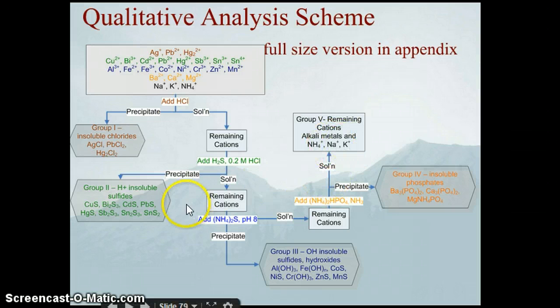So there's nothing that we can add. We can't come up with a cation or an anion to add to this solution that would precipitate those out. So sadly, using this analysis, this qual scheme, if you will, only identifies the presence of group 1s through 4, because group 5 kind of can always be there because we can never get any sort of visual evidence in terms of a precipitate that these ions were actually in this solution.